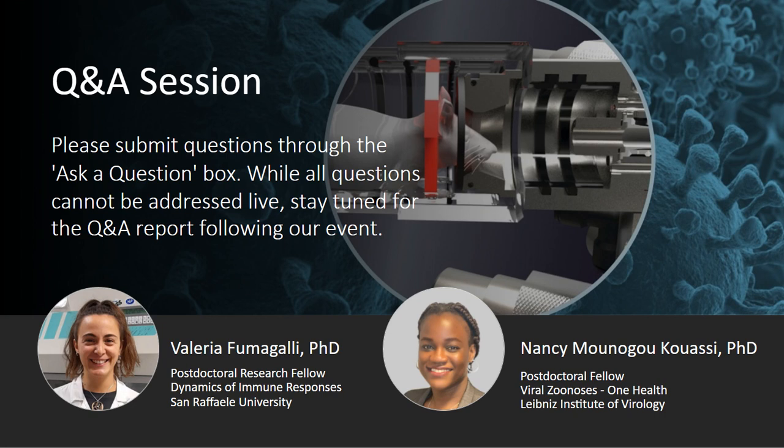Yeah, makes sense. Valeria, another question for you. We've got a few about the aerosolization process. Can you speak to whether the aerosolization process reduces the infectivity of the SARS-CoV-2 virus, or if it destroys or damages the viral particle at all? Okay, this was one of my fears at the beginning, because I was not sure that the virus stays alive upon aerosolization. But given the same starting concentration between the two routes of infection, and at the end I see the same viral RNA in the lung, I can say that all the viruses that I nebulize stay alive, so remain viable.